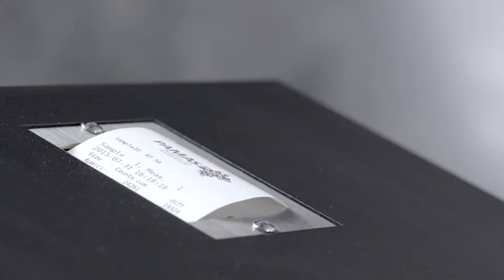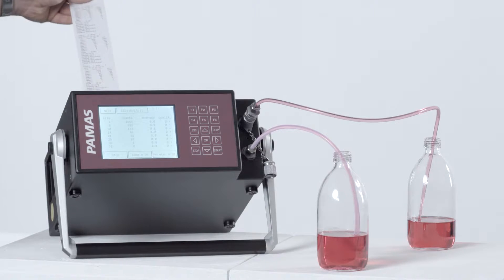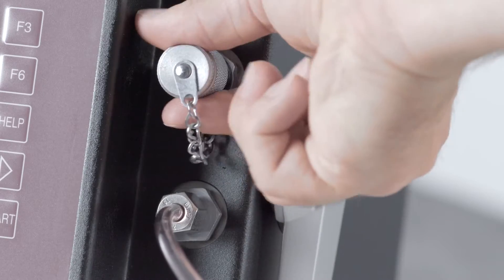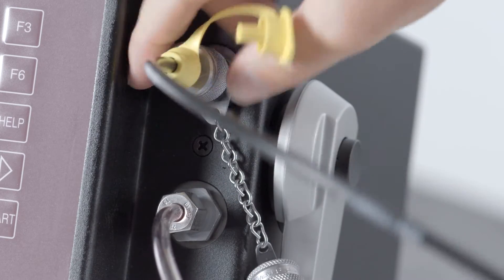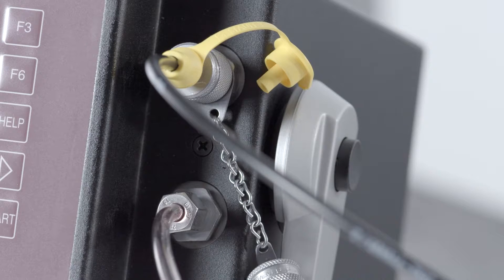Measurements can be stored internally on the instrument or printed with the integrated thermoprinter. The PAMAS S40 has the capability to perform measurements both online and offline.